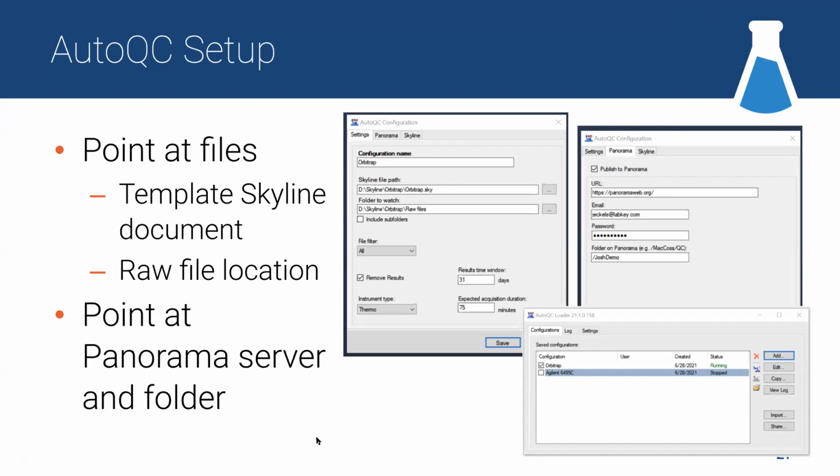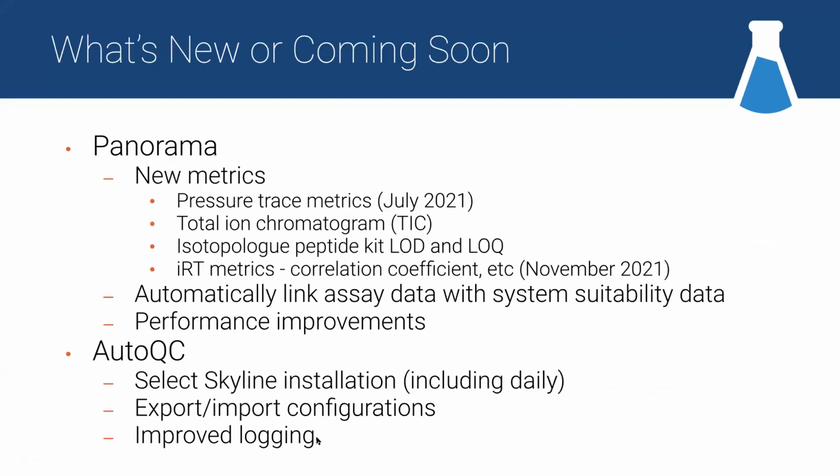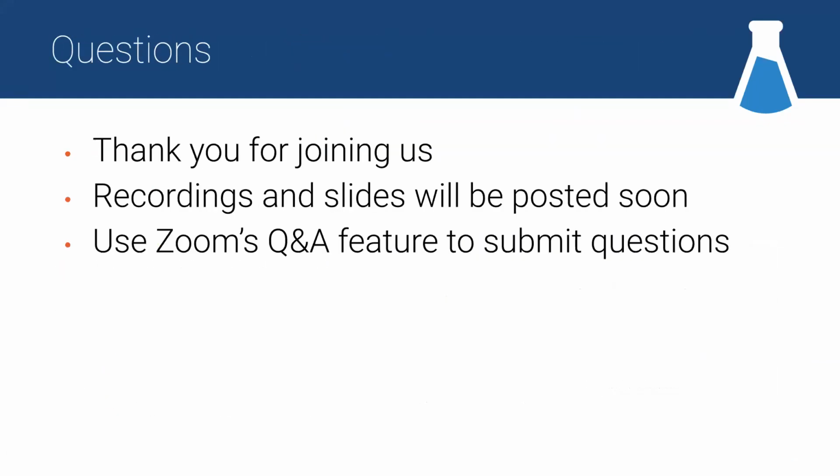So you're extracting based on a predicted or expected ion mobility value, and that can drift, just like your mass calibration can drift. So yes, there's work to be done there. It's definitely on our radar going forward, but it has to happen in Skyline first, and then it will get propagated to AutoQC. Great, thanks.